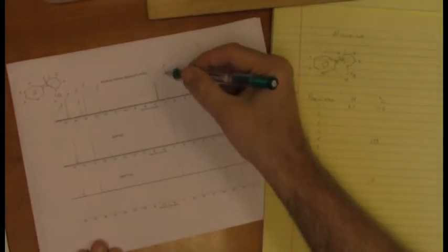We see them in the DEPT 90. 4 of them aromatic, 1 of them not aromatic. That has to be position 6. That one should jump right out at you as well. Therefore, we have the carbon at position 6, and its chemical shift looks to be about 68 ppm.